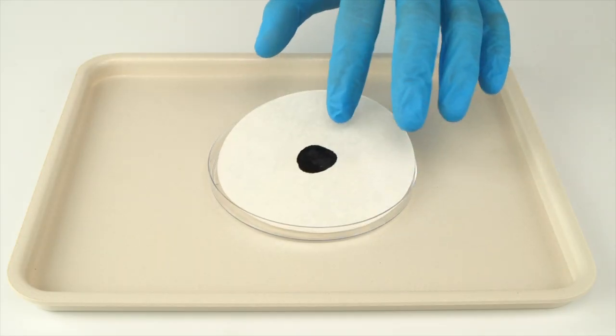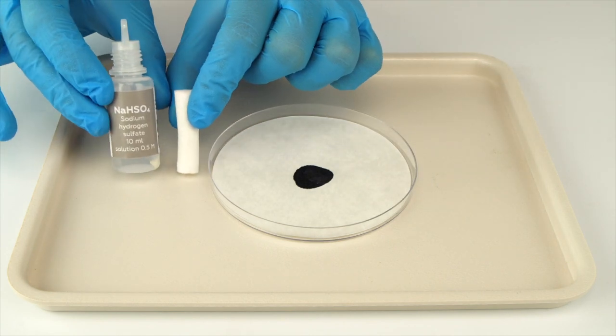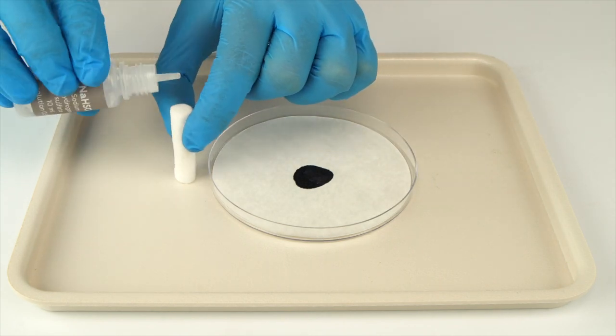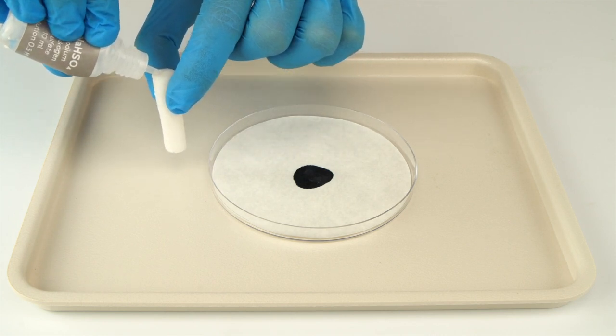Put the filter paper in the petri dish. Now, take the cotton cylinder and drip sodium hydrogen sulfate solution onto one end. Keep going until the solution starts dripping from the other end of the cylinder.